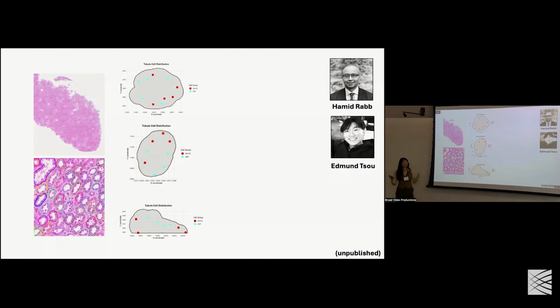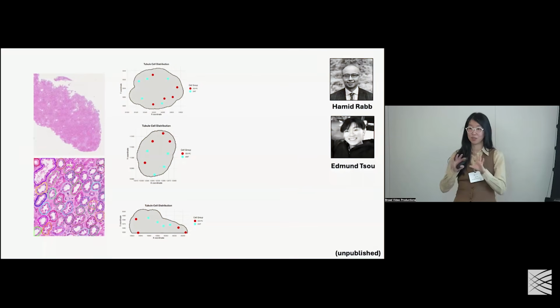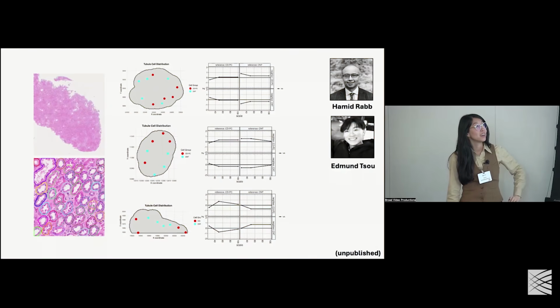But now we can apply these same tools and say, what is the gene expression similarity across tubules? What is the cell type spatial organization? Are there certain tubules that are more intermixed? Are there certain tubules that are more segregated? And I think, in general, we have the computational methods to quantify these relationships in a very high throughput statistical manner and pull out interesting patterns.